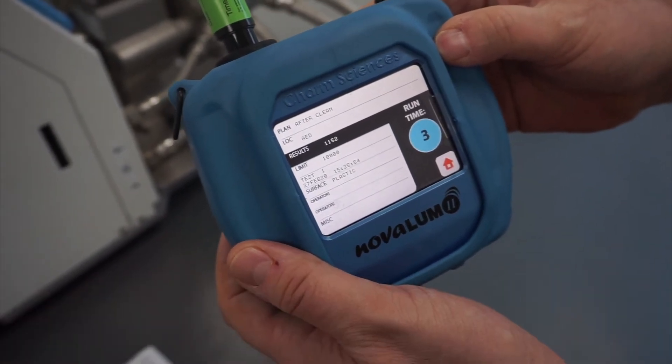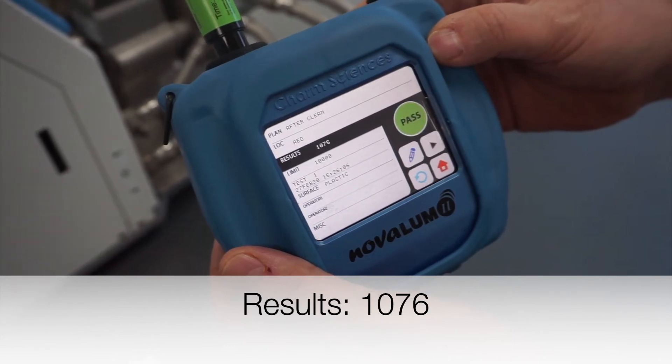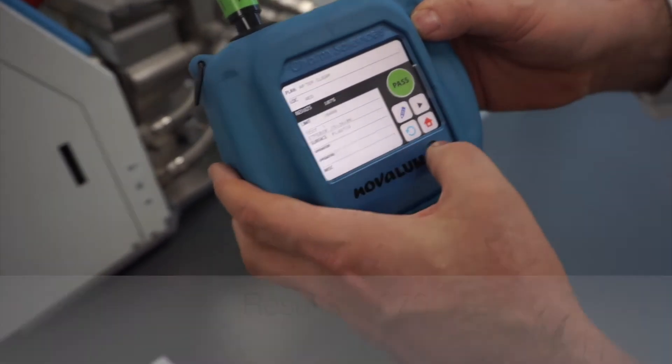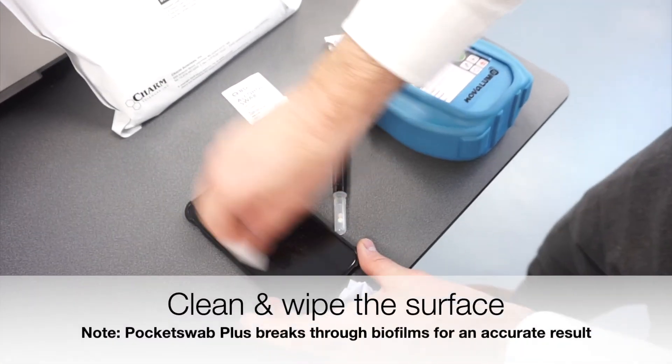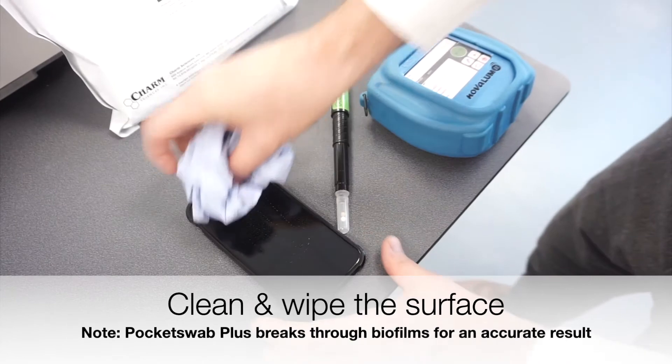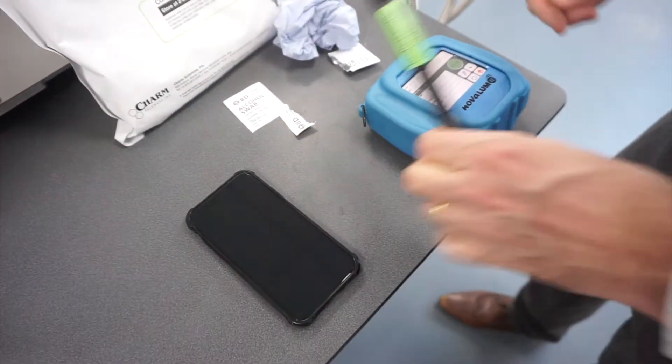Five seconds later we get a result. I'll swab just to clean the surface and clear off the surface, and then we'll rerun the test.